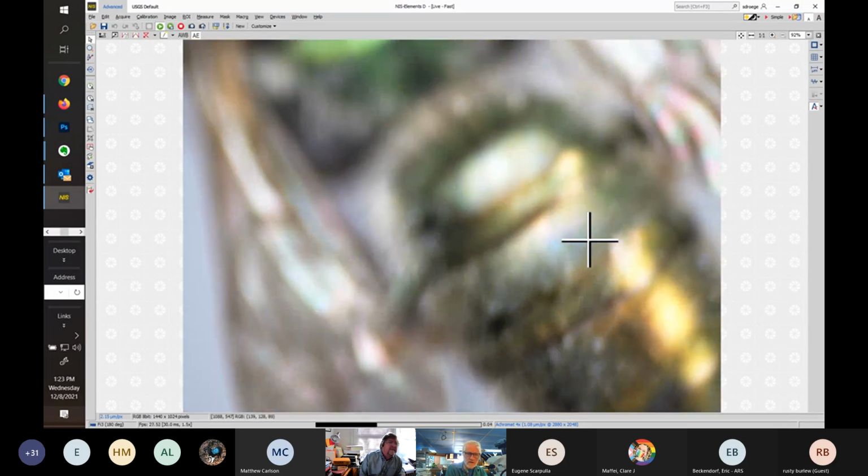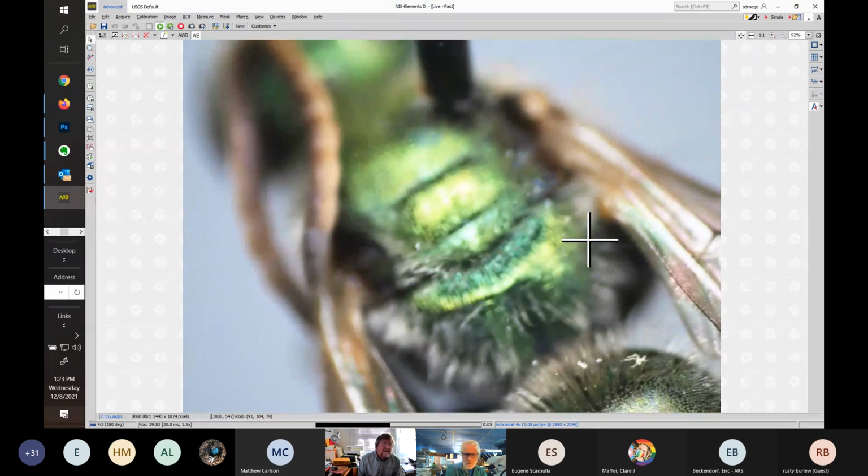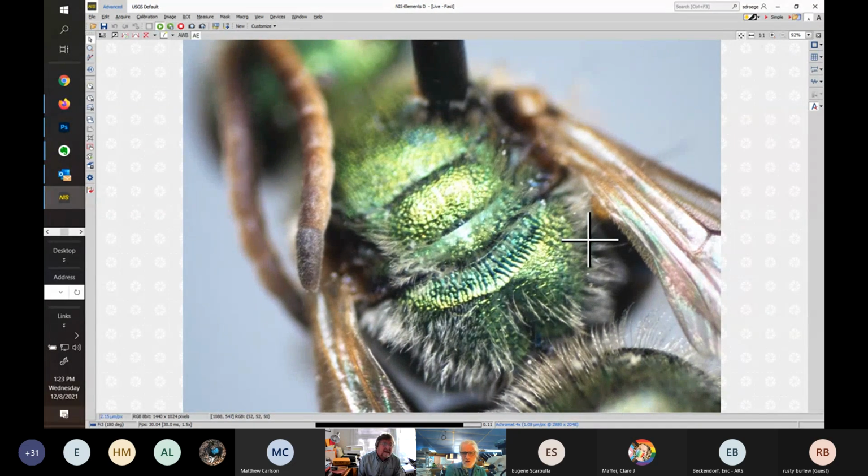Take a look here at the metanotum and propodium. Well, this one could be ambiguous, right? That's still in there. The metanotum and the posterior surface of the propodium are equal in length, and generally in aurata that posterior surface of the propodium is longer medially. And it would be closer to this distance. Yes, but we're talking subtleties here, obviously.